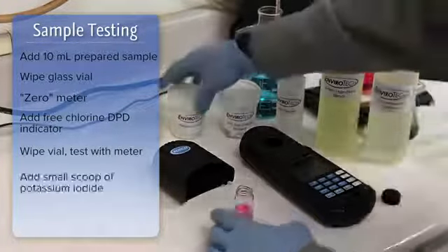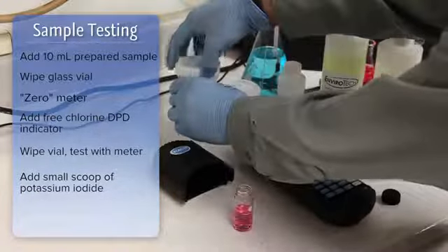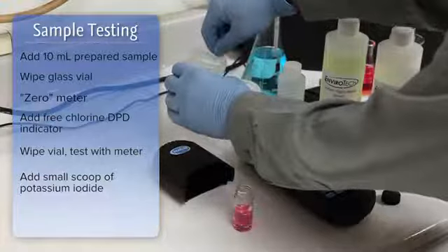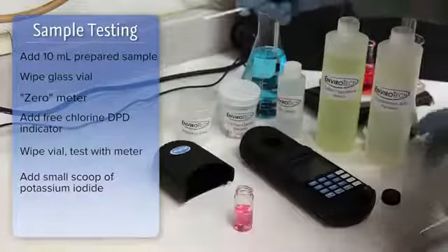Now we're going to see how much chlorinated species accompanies the bromine. We're going to add a few crystals of potassium iodide to liberate the chlorine from the N-chloroglycine complex to react with the DPD reagent.